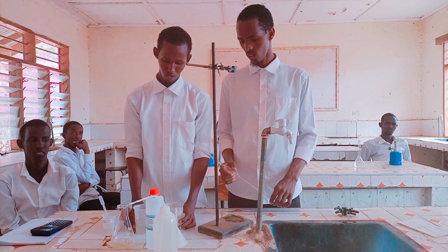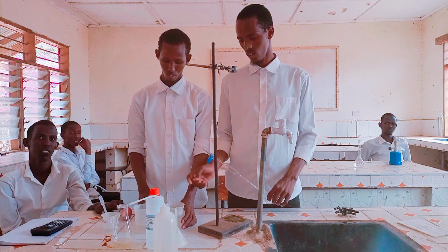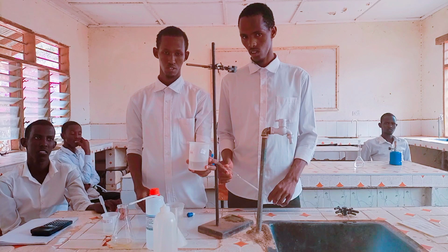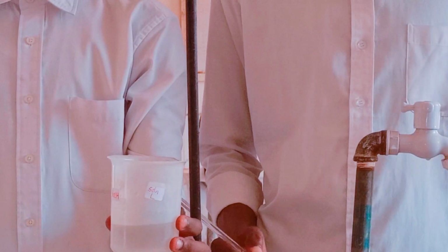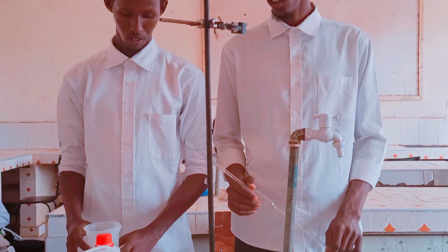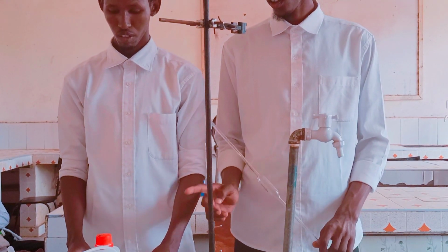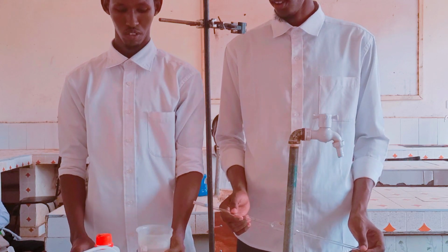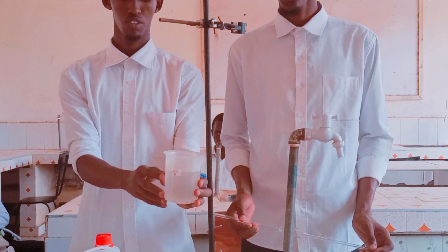In our case, the standard solution is sodium hydroxide because we are given the concentration, which is 20 grams per liter. The analyte is the one we are going to analyze, the one we are looking for its concentration, and that's hydrochloric acid, solution N.